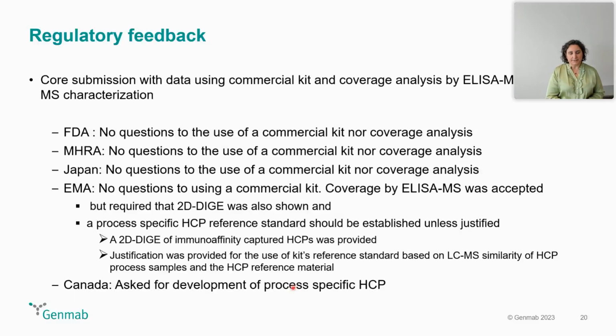And then last, Canada asked for development of a process-specific HCP ELISA directly. At that time we weren't able to justify the use of a commercial kit, and our partner decided to go ahead and start developing a process-specific HCP ELISA.